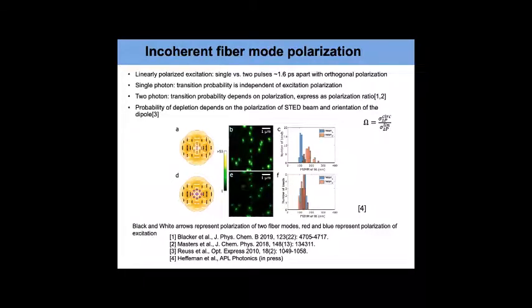What happened here seemed to be a combination of the polarization dependence of the transition for two-photon excitation, as well as the efficiency of your STED depletion.